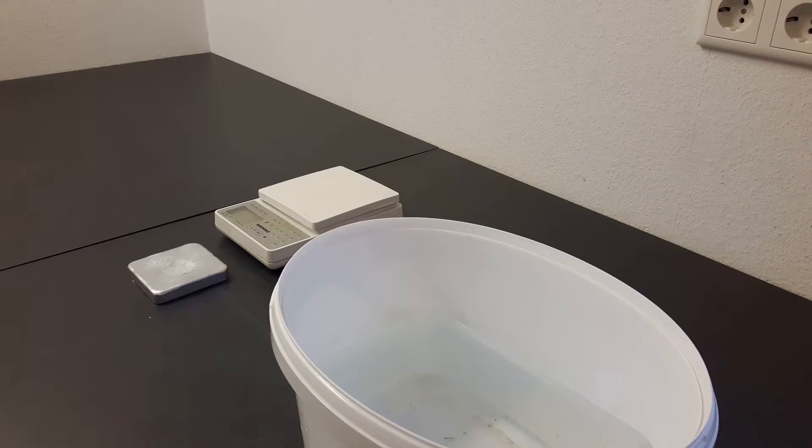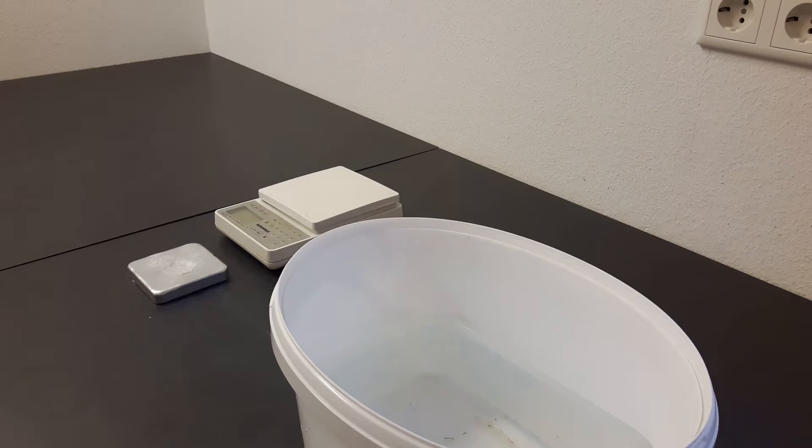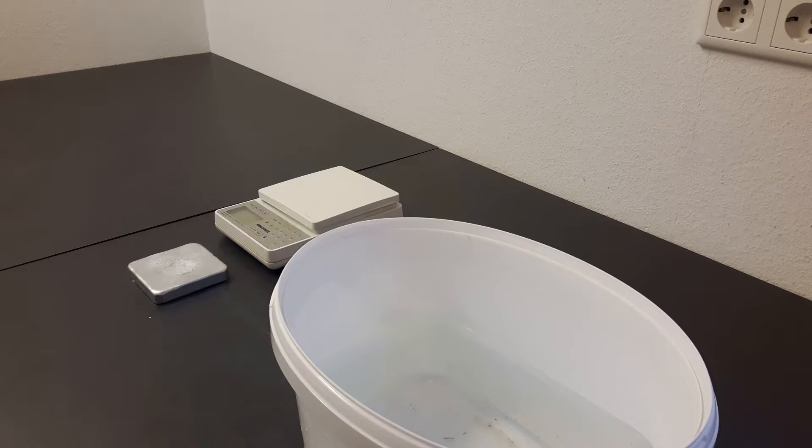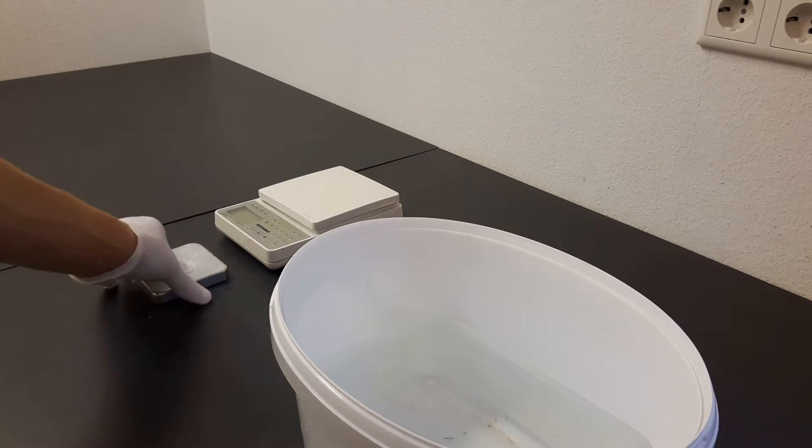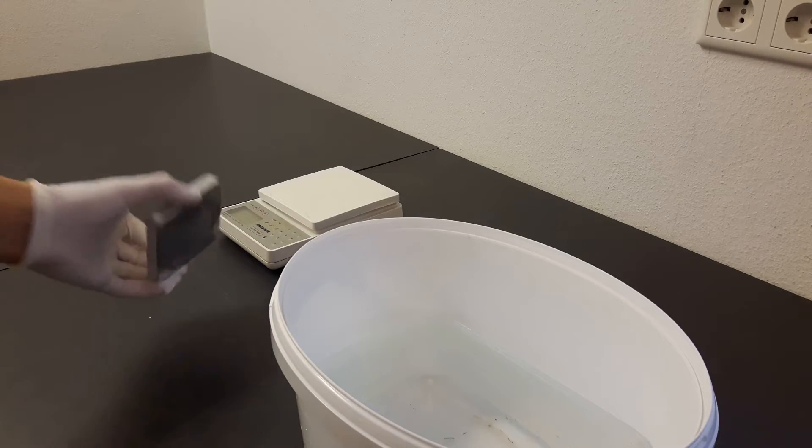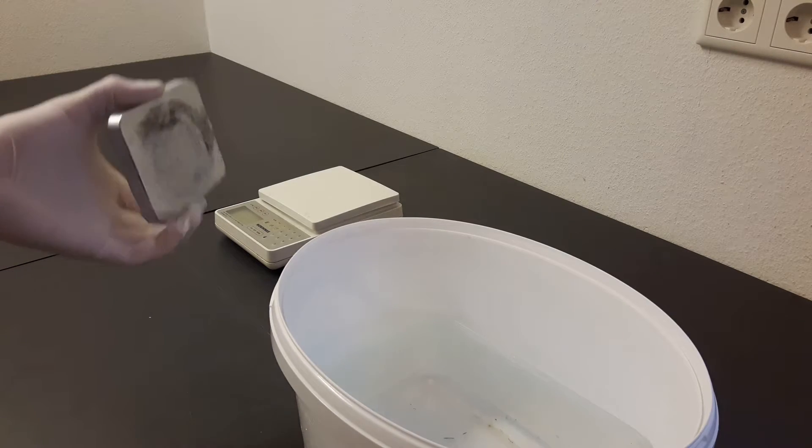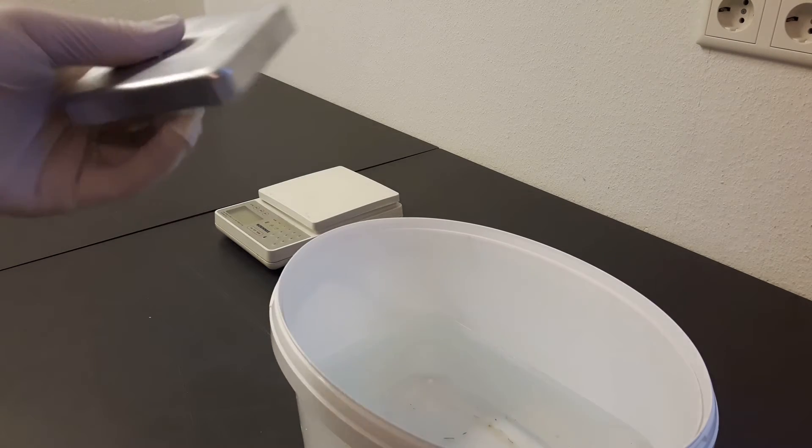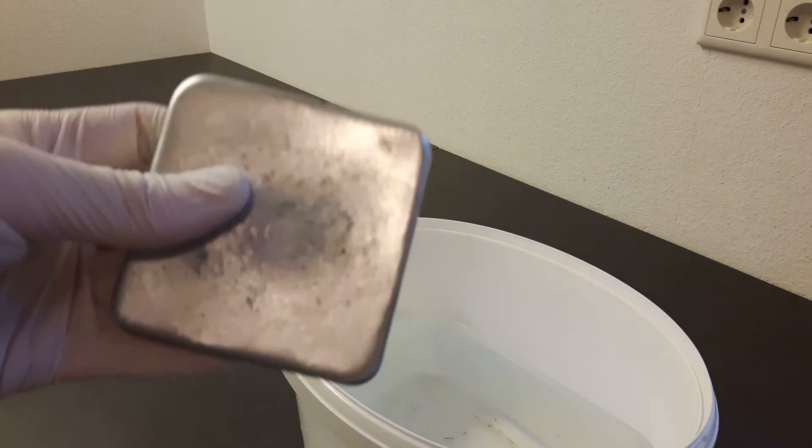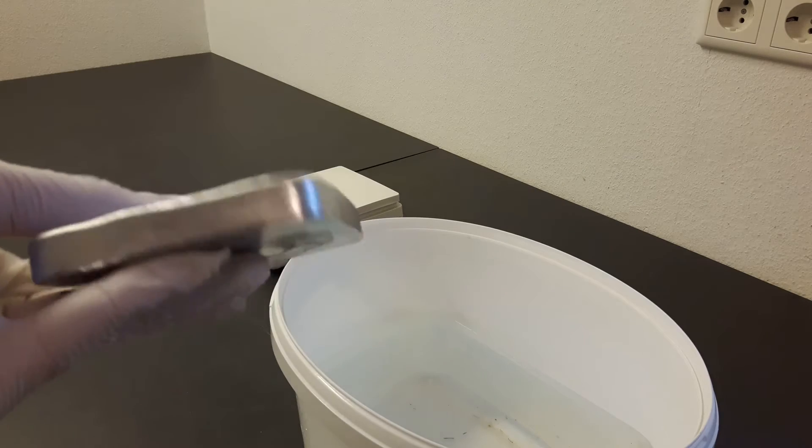Hi, in this video I'm going to determine the purity of a zinc ingot I cast from balancing weights a few months ago by checking the density.